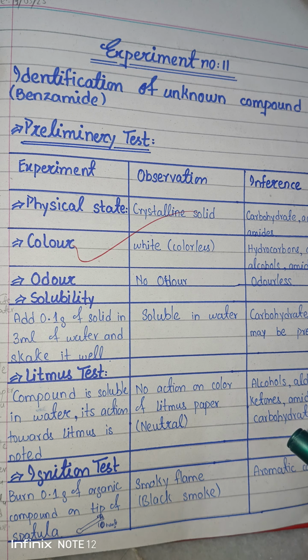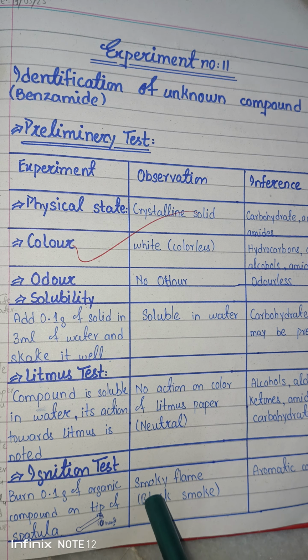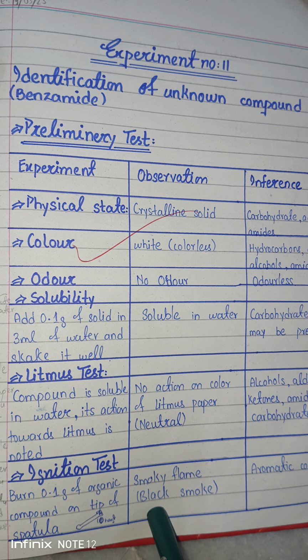The color and appearance of the flame tell us whether the compound is saturated or unsaturated, or whether the compound is aromatic or aliphatic. In the case of benzamide, the flame is smoky and black smoke appears.